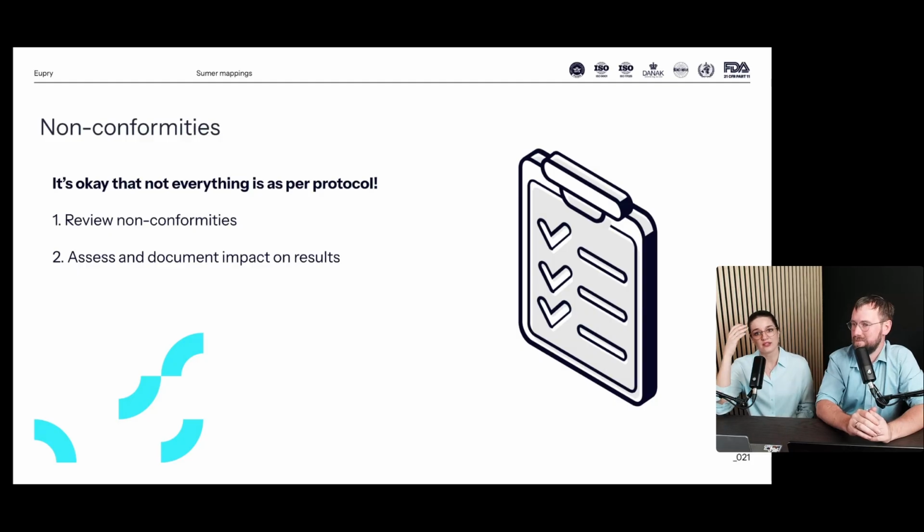It happens a lot. They can be removed by someone who was not advised about the mapping. So this is another thing that we also talk about: let's put some signs to tell people that we have a mapping going on. We do have this documentation as part of the test plans as well. And I guess we'll also often see things like probe failures, if something broke, doors that have been opened many times, or opened for too long or too short, whatever it might be.